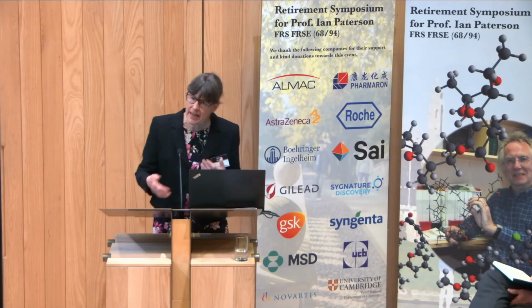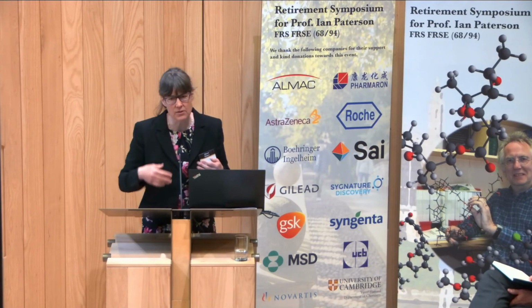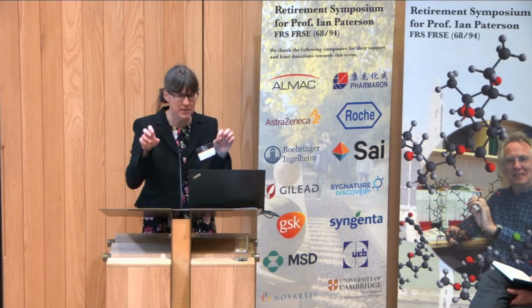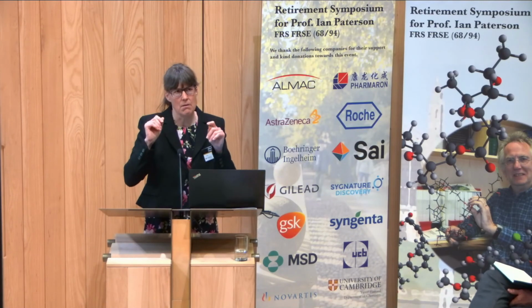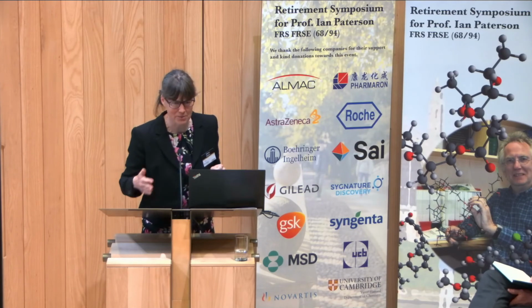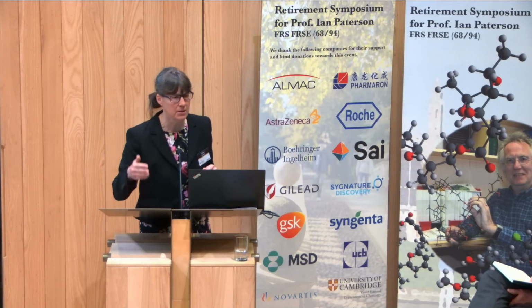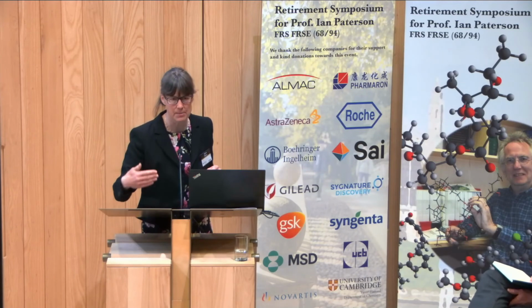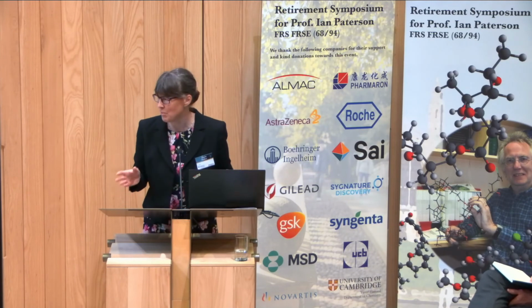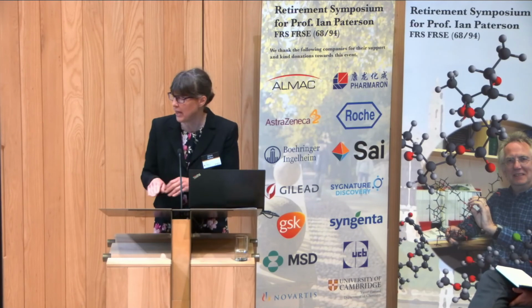And Wei Min gets around this by using 10-to-1 concentration ratios of things in polymer beads, but we were interested in being able to track things similarly. If you talk to Martin, the man who's actually running the microscope for us, he doesn't want to have to retune the microscope in terms of laser intensity every time he takes an image, because basically that causes problems straight away. You don't get comparable data if you start having to do that.